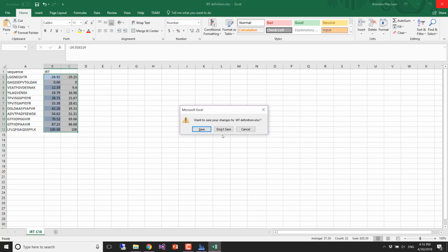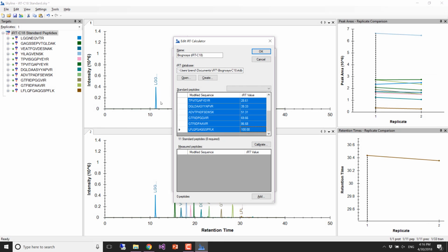So let's go ahead and close. And don't save that.